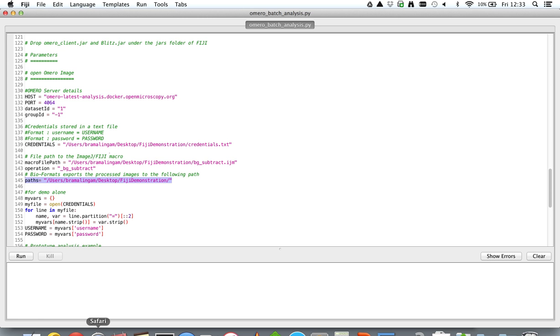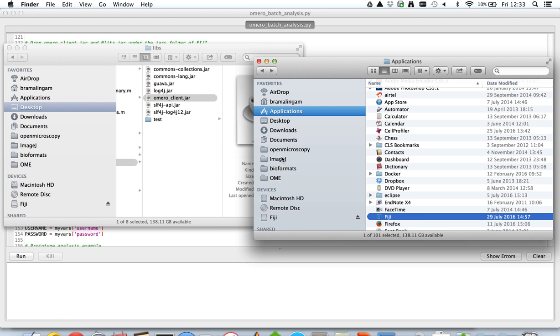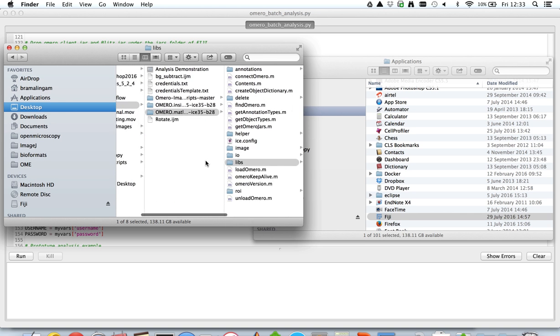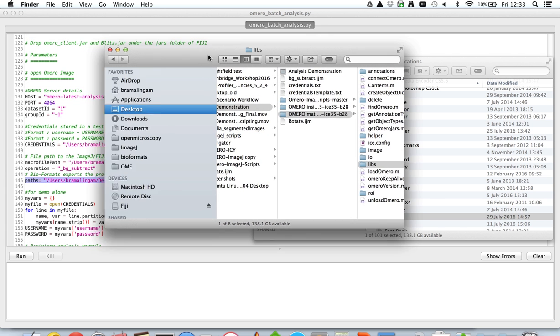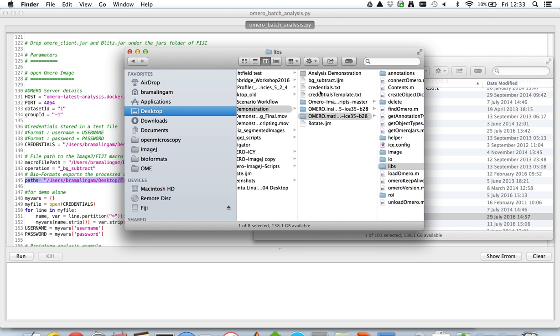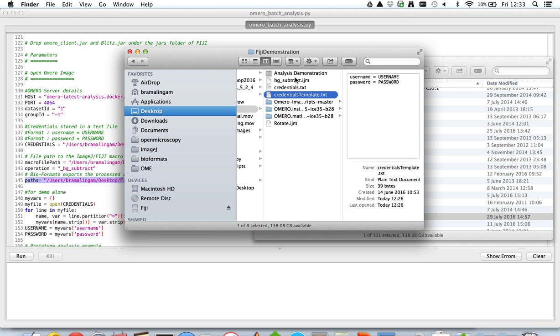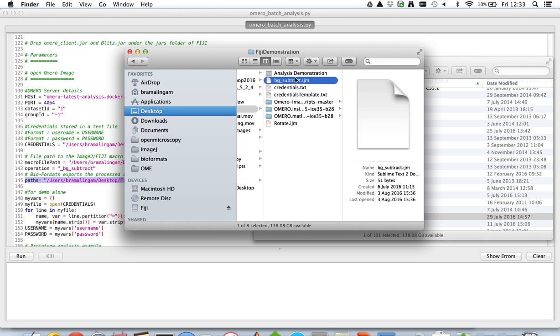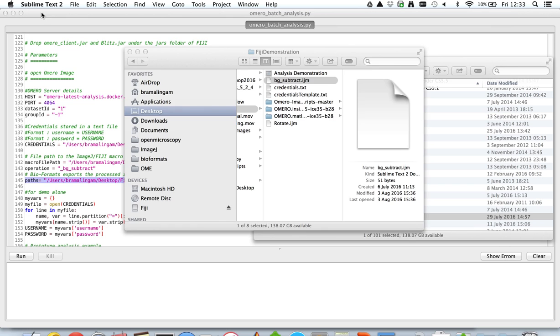So let's look at the two files that we've not looked at so far, which is the credentials file which needs to be in the following format: username equals your username, password equals your password, and this gets read by the script. And then this script also consumes an ImageJ macro, and in this case it's a background subtraction macro, it's a really simple and straightforward macro.